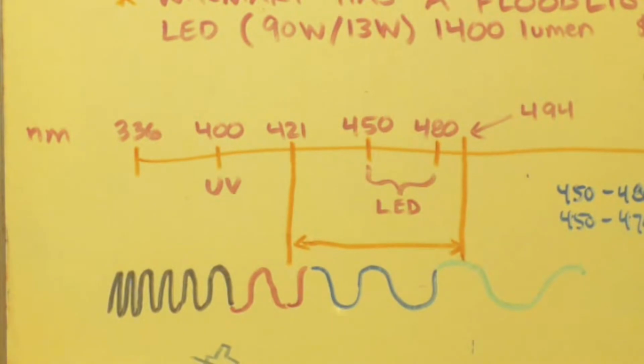Now, remember if you watch my video on benzyl chloride via free radical halogenation, you'll know that I talked about intensity, and I said if you only have 1 photon per hour coming out of your bulb or your light source, that's going to take you forever. You'll be breaking one bond a second. It'll take forever and ever. So intensity plays a part. You need it to be strong enough. Being blue light makes it strong enough to break the bonds, okay?